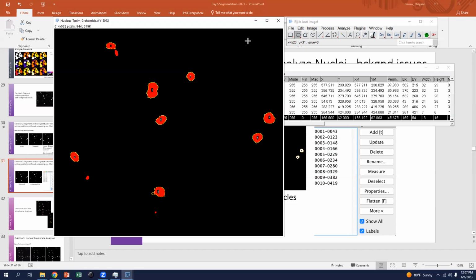White background here. We try that. Also try this. Process, binary, options. Now let's try process.